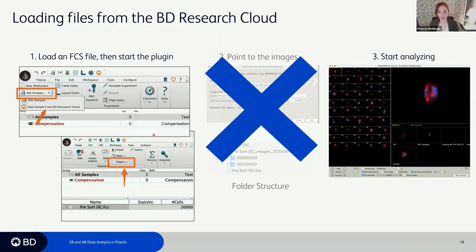Now the caveat here, with any cloud storage, is that it's of course sensitive to internet connection. So you'll need to be on the internet to download and upload, at least initially. And when you have data stored locally on your device, it tends to load faster, just because it's already nearby.